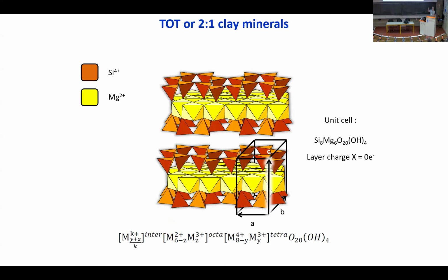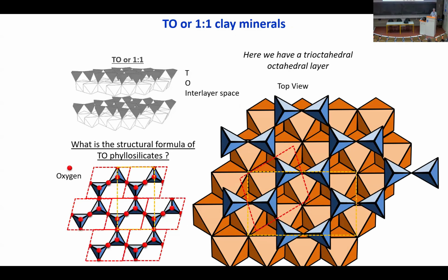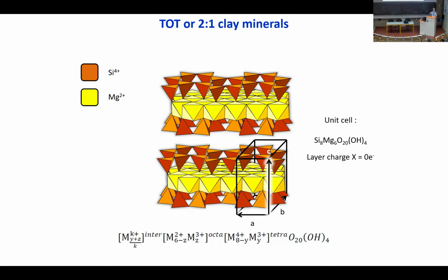From that simple information, you can clearly see that essentially all phyllosilicates will have the same dimension in the layer plane, and that their main difference will come from the layer to layer distance, which is controlled by how many sheets of tetrahedra or octahedra there are, and by the nature or presence of interlayer cations or interlayer species. That will be the main difference between any of the clay minerals. And this will make a very strong condition for their identification.